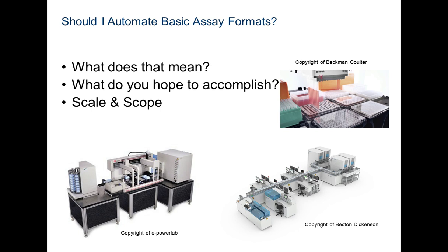Automation, to some people, means large systems that process hundreds of plates in a day in a walk-away fashion. To other people, automation can mean simply using a liquid handler or a stacker. Me personally, I think it encompasses all of these things.